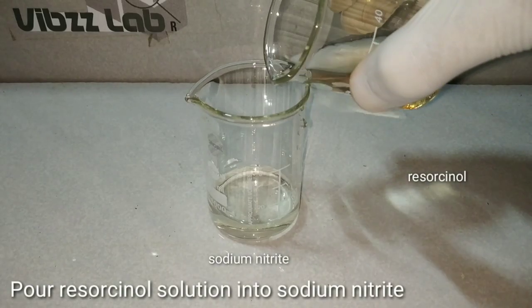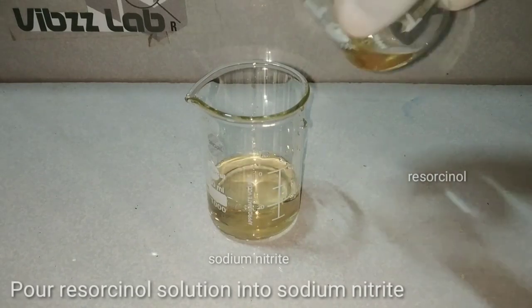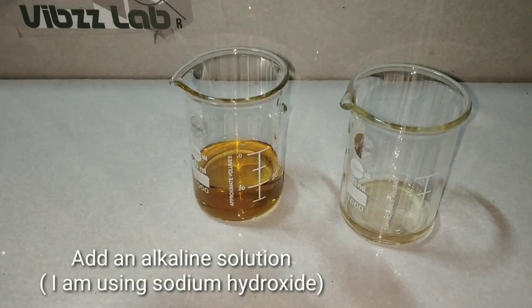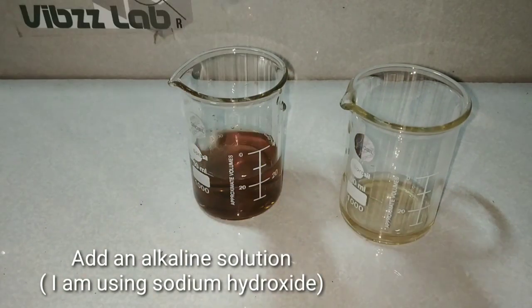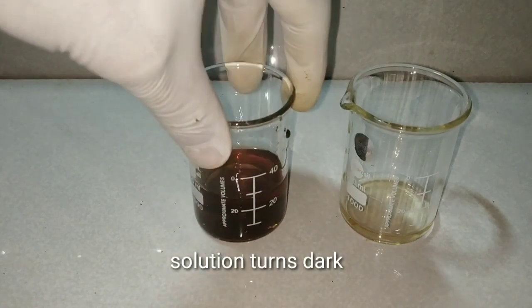We are adding resorcinol into saturated solution of sodium nitrite, and this produces an indicator called lacmoid. Lacmoid will give dark coloration on adding a basic solution. You can see that here.